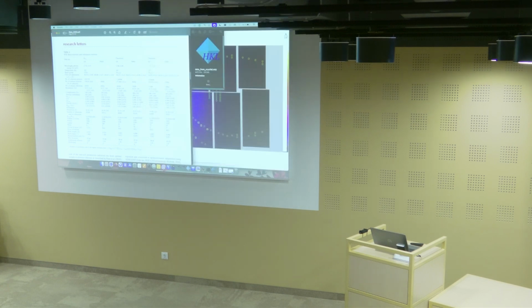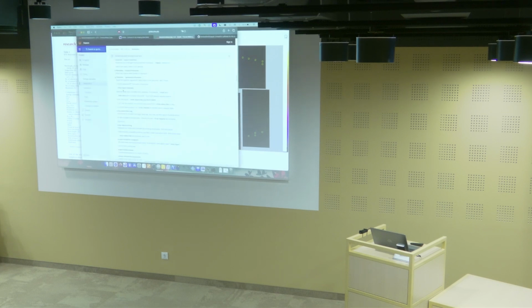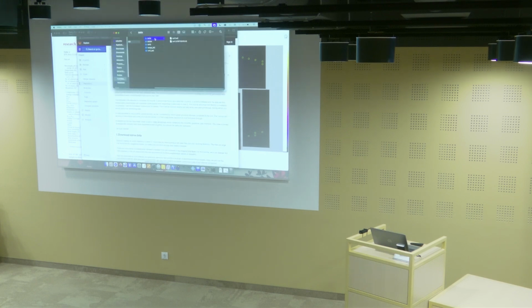So that was very quickly on how to use CrystFEL. So again, if you're interested, you can go through the full tutorial, which is over here. By the way, that data file that I downloaded is a single file. Nevertheless, it's almost 100 gigabytes, so you still need a bit of space on your computer to download that.